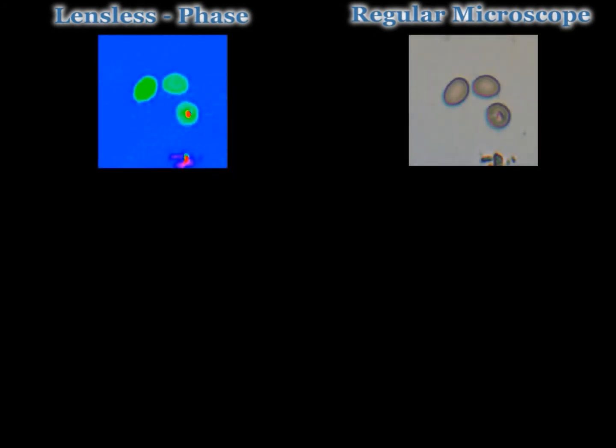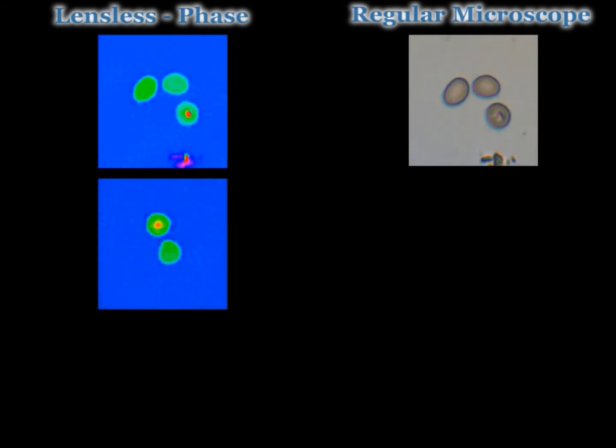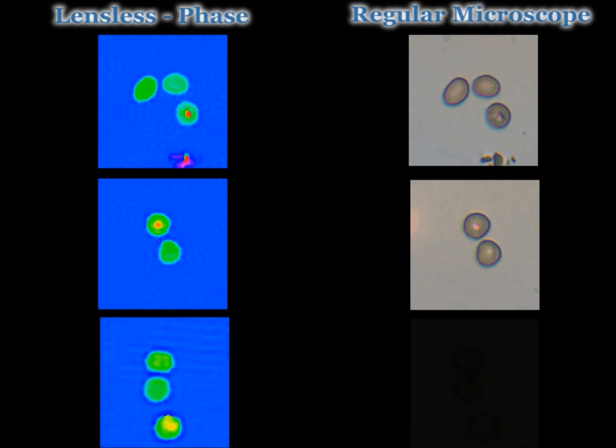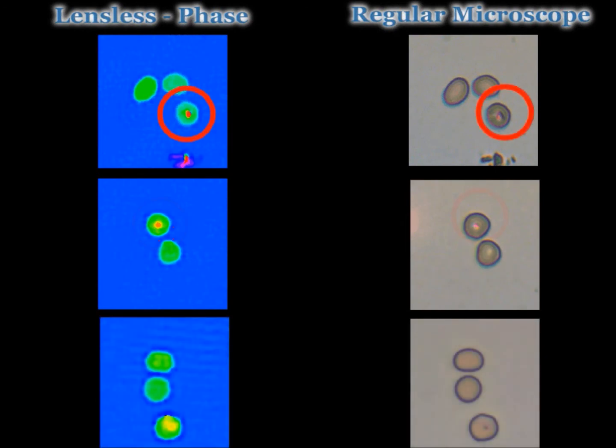An example of a real-world application for our device would be malaria diagnostics in remote locations. To show the potential of this device, we've imaged malaria parasites cultured in blood. As you can see here, we can distinguish the infected blood cells from the healthy ones.